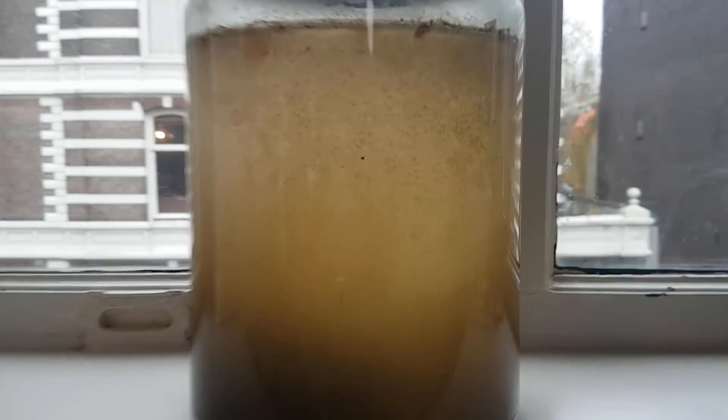At some point, I couldn't look inside the ecosphere anymore, but I was still able to come to the conclusion that all the brine shrimp died, and I didn't really know why.